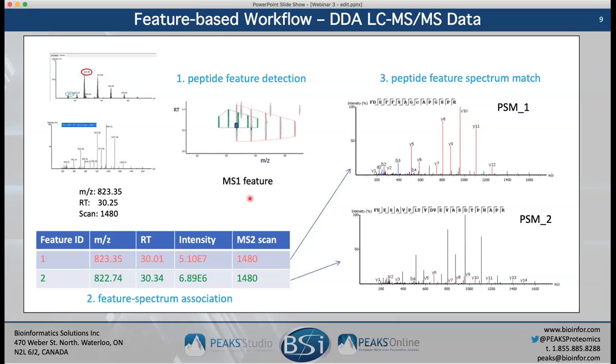And so what we can tell from the multiple features is that there are 2 distinct features here, and they're both in the same MS2 scan. And so what we can actually identify is the more abundant, or in this case, the higher intensity red feature, which actually sequences very nicely to the more abundant MS2 ions, and then the lower abundant MS2 feature, which also includes these peaks that weren't identified in the original.